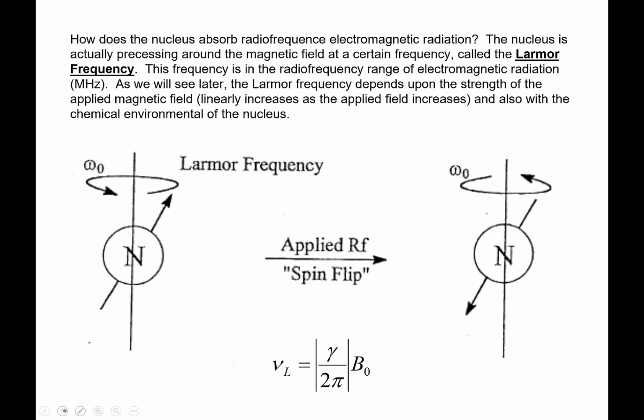In the days when we had radios, we have things like kilohertz for AM radio, and then megahertz for FM. There's an analogy. But this is in megahertz.